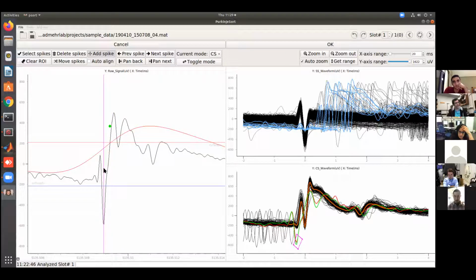What I want you to pay attention to is this green thing here, and that I have a spike here. And now if I do this, now this spike has been added. Basically, I just changed this green thing to a new spike here. So this is my new one, and this changed. If I do it again, I want to align it here. This is just changing the alignments, okay?